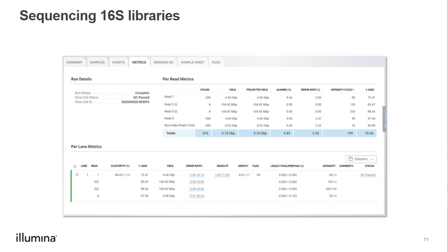All right, so when we check the aligned percentage, we see that it is 9.36. So 9.36% of the data is going to PhiX. We spike in a higher PhiX percentage when we're sequencing the amplicon libraries because we want to add that diversity that we don't have with these libraries compared to the shotgun metagenomics libraries. And so here, this higher alignment percentage is expected.